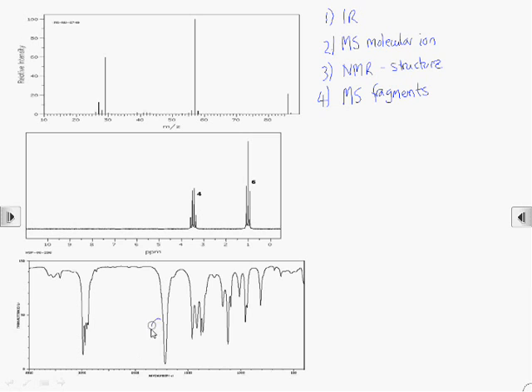So let's start with the infrared. There's a carbonyl C double bond O at 1750 wavenumbers here, and possibly a C single bond O stretch around about 1120.